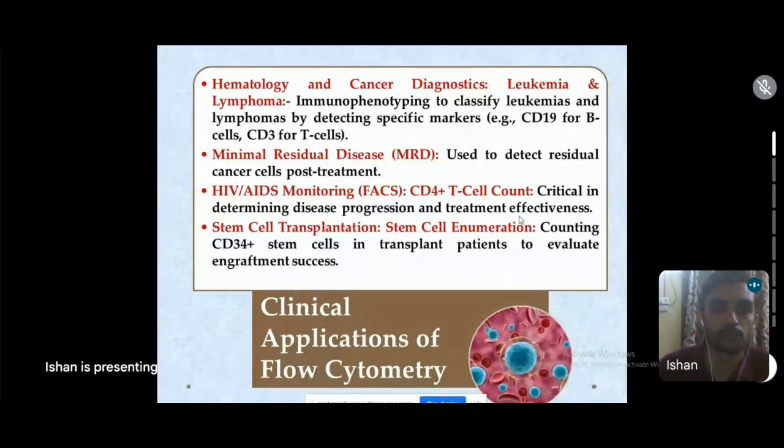These are the terms I am talking about in a basic talk, which is not that detailed. If you want to go for initial analysis of any leukemia phenotyping or any kind of analysis, then you have to get trained for 7 to 8 days on a single topic, and that will be more detail oriented, more about the software and the analysis part.